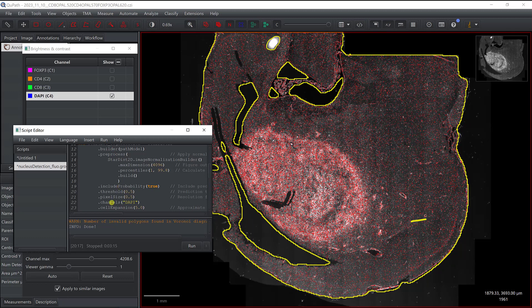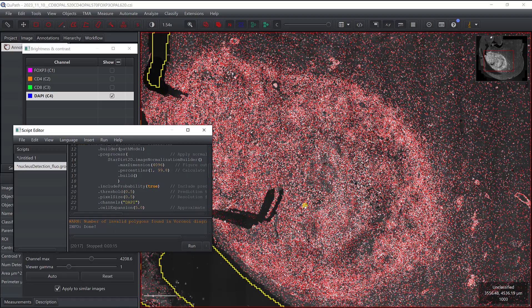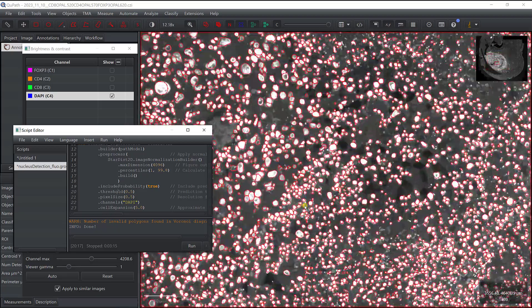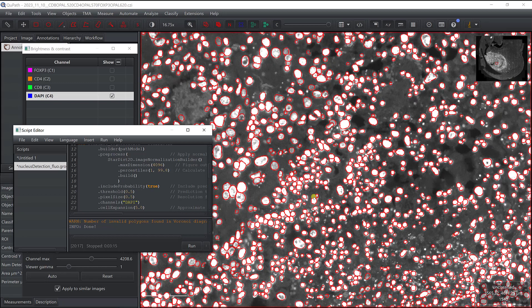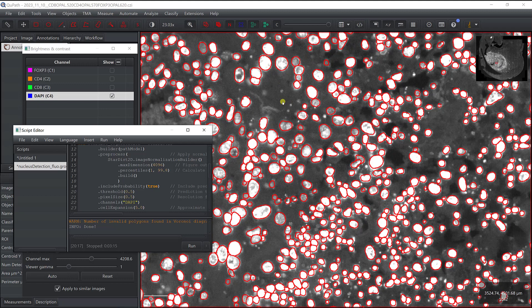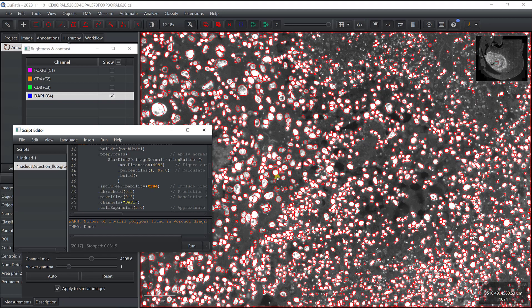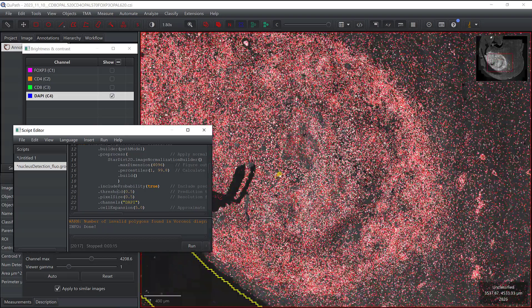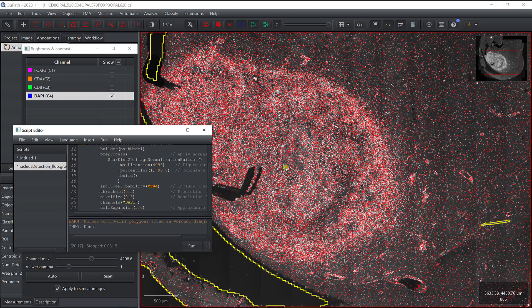It's done — it took about 3 minutes and 15 seconds on my computer with the GPU version of StarDist. It might take a bit longer on CPU but should still be manageable. The segmentation looks like it did a decent job. You can see some small structures that you might or might not want to detect, so adjust the parameters accordingly. You are the expert on your images, so make sure you're making the right decisions to get a good segmentation.